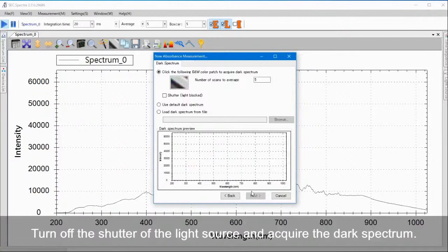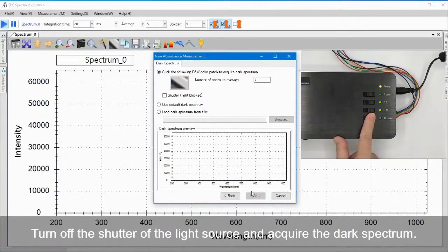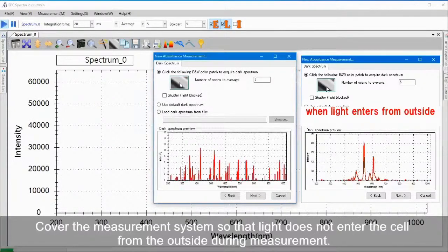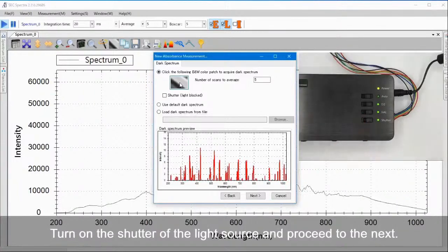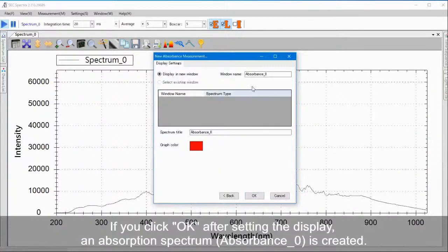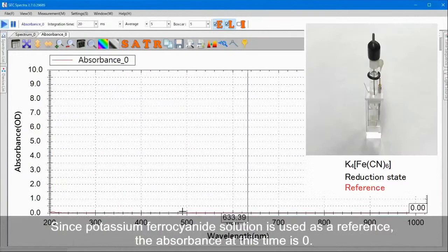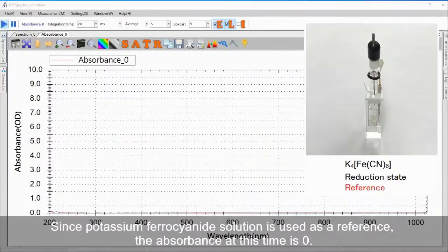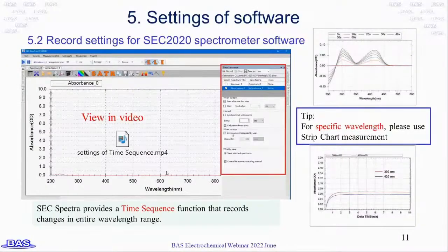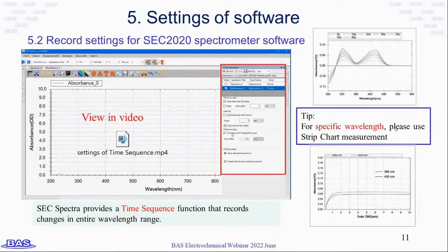Turn off the shutter of the light source and acquire the dark spectrum. Cover the measurement system so that light does not enter the cell from the outside during measurement. Turn on the shutter of the light source and proceed to the next step. After setting the display and clicking OK, an absorption spectrum with absorbance zero is created. Since potassium ferrocyanide solution is used as a reference, the absorbance at this time is zero. For the second step, set up the record settings for SEC 2020 spectrometer software. SEC Spectra provides a time sequence to record spectrum changes in the entire wavelength range. For specific wavelengths, please use strip chart measurement.